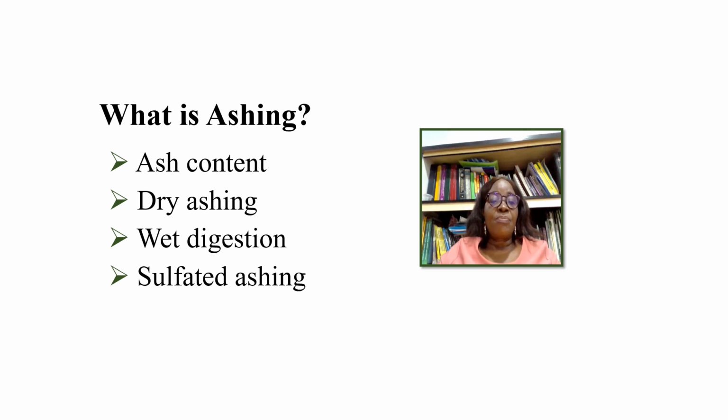Ash content represents the total mineral content in food, and it is part of proximate analysis for nutritional evaluation. Ashing is the first step in preparing food sample for specific elemental analysis. Ash is an inorganic residue that remains after the removal of water and organic matter.